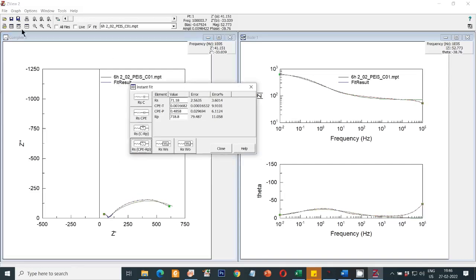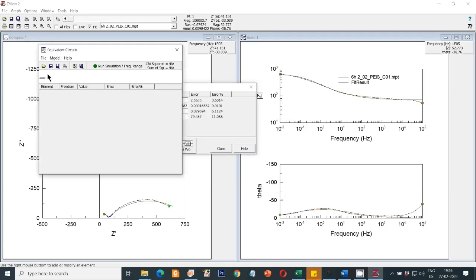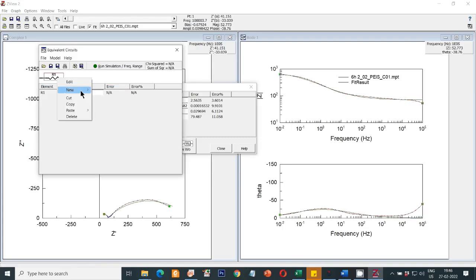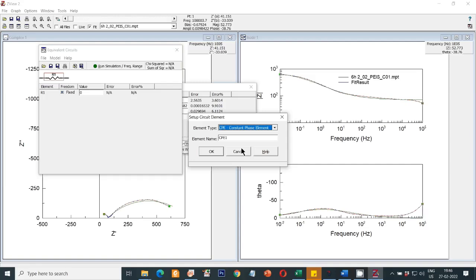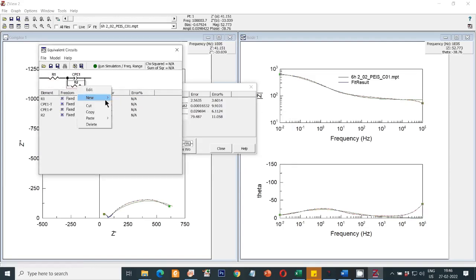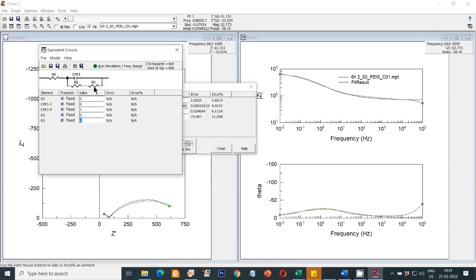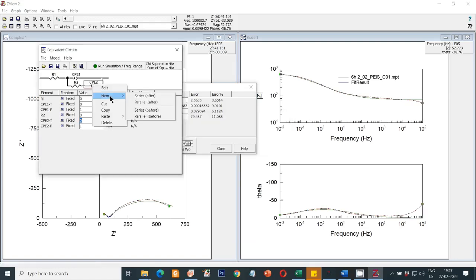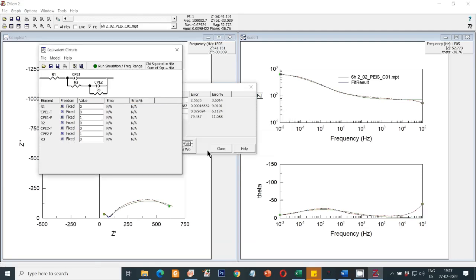To fix this, go to the equivalent circuit option and manually draw the circuit. You can edit and add new components. First I will add a resistor, then right-click to add a constant phase element, then in parallel one resistor, then in series one resistor — or you can edit it — this would be a constant phase element, and again in parallel one resistor. My equivalent circuit is now complete. Then you have to change the fixed values to free ones.